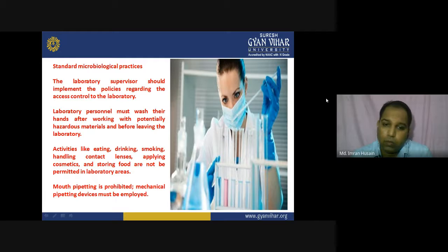Mouth pipetting is prohibited. Mechanical pipetting devices must be employed. Because you don't know, before you, anyone else may have been working with that very pipette, what sort of experimentation he or she might have done, and what type of microorganism he or she might have used.